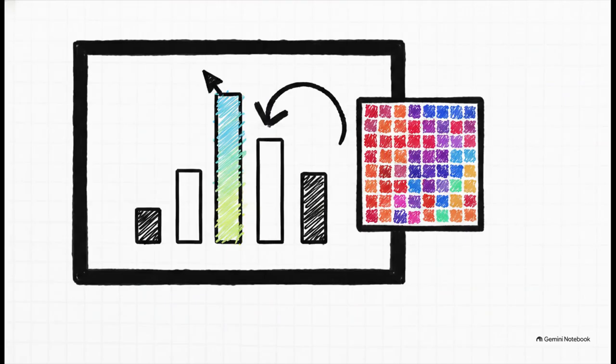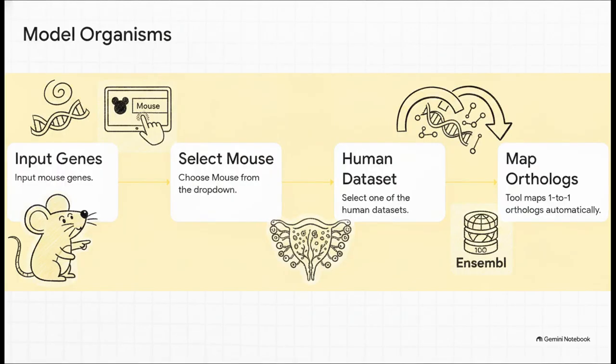And boom, within moments, you aren't just looking at some dry, boring text file. The tool generates fully interactive bar charts. That means you can hover right over the bars on your screen to see the exact enrichment scores, the fold changes, and the cell types. Even better, if you click directly on a bar, the tool instantly generates an expression heat map for those specific genes. This lets you visually verify the enrichment across the different cell clusters on the fly. It is incredibly intuitive.